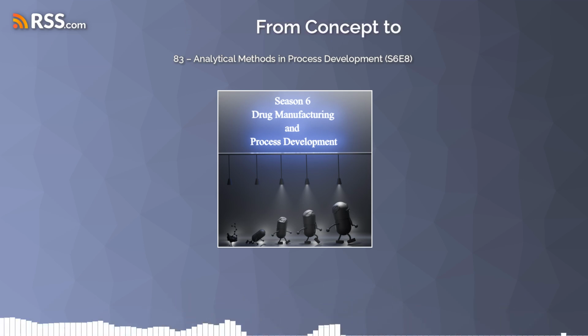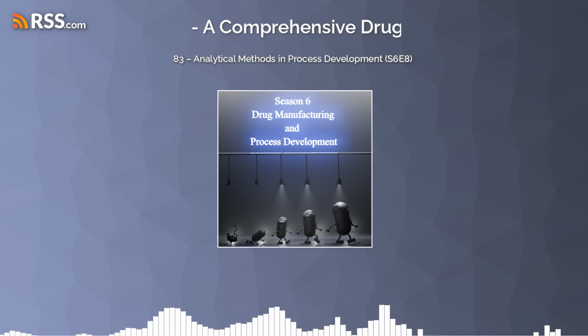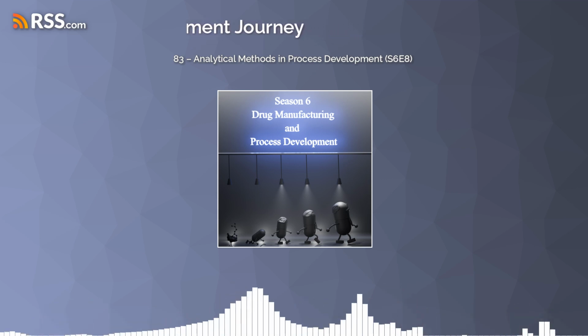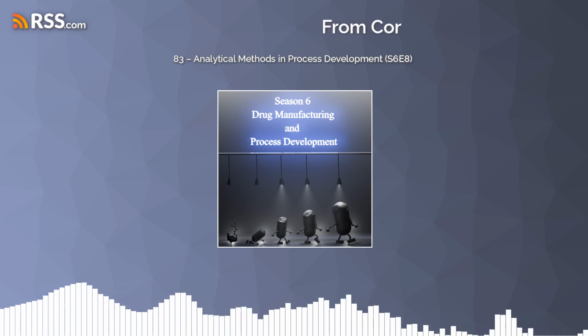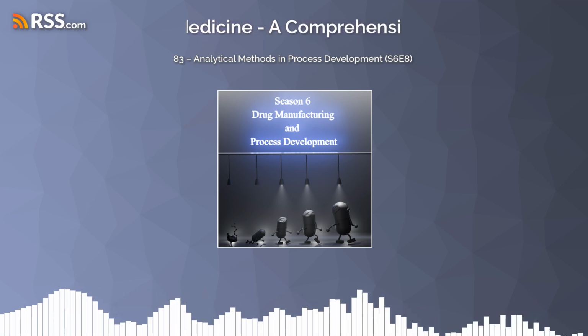So first, HPLC separates all the different components in your reaction mixture, and then each component comes out of the HPLC column and enters the mass spectrometer, which basically measures the mass-to-charge ratio of ions. Right. And this is a really precise way to identify each compound, because each molecule has a unique mass, right? Exactly. It's like a molecular fingerprint. So you're separating everything and then getting a really accurate molecular weight.